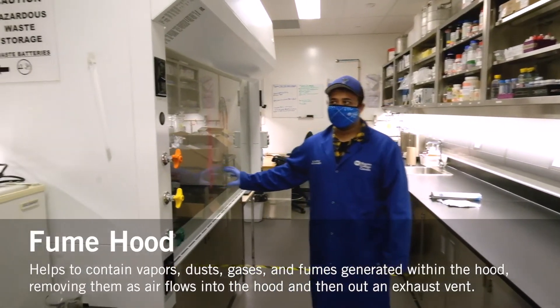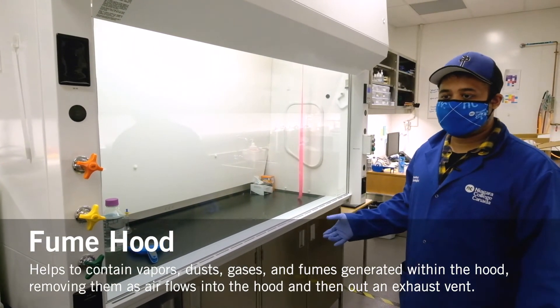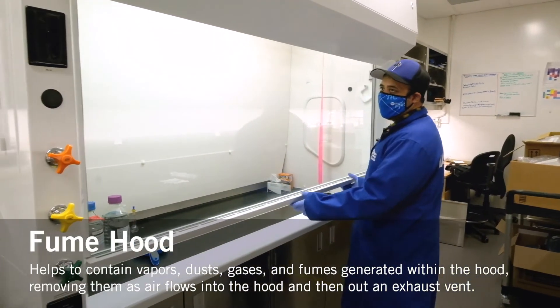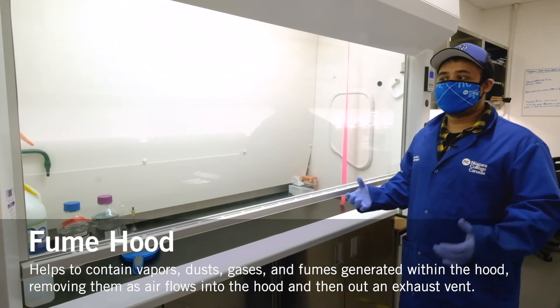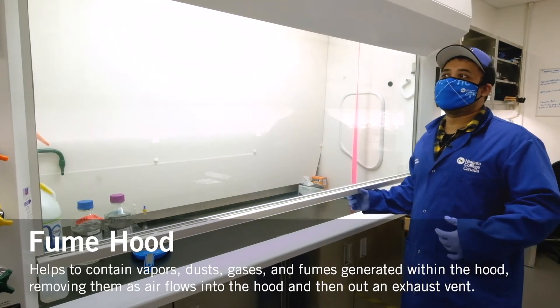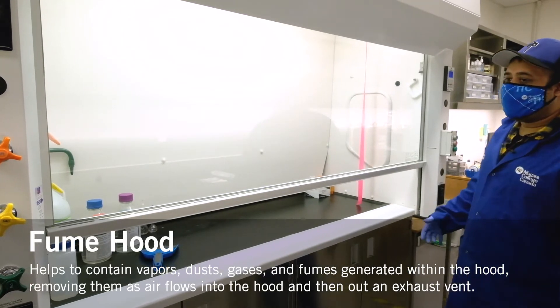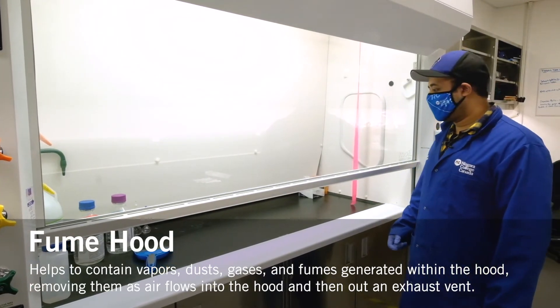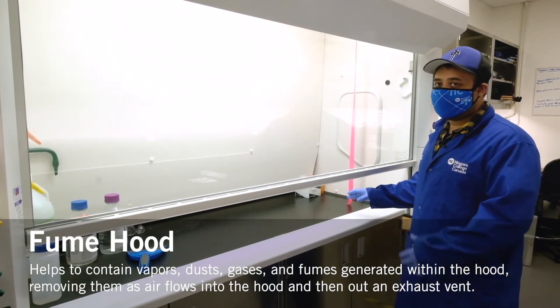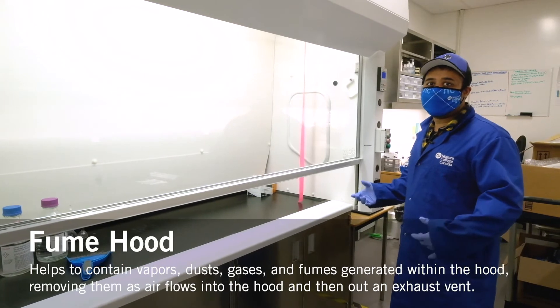This is a fume hood. It's essentially used when dealing with caustic chemicals or any kind of chemicals that have a strong odor. Basically it provides like a ventilation atmosphere so you're not exposed to toxic fumes or caustic smells or hazards that might be present. Any kind of strong acids, strong bases, or sensory chemicals — if you don't want to expose yourself to those, it's a really good idea to work in a fume hood so you're not inhaling any toxic fumes or anything hazardous to you.